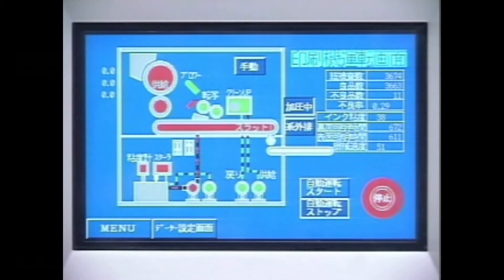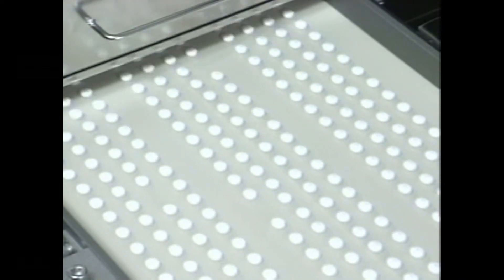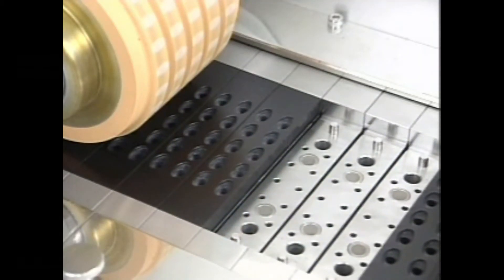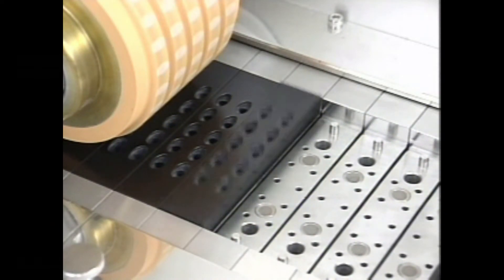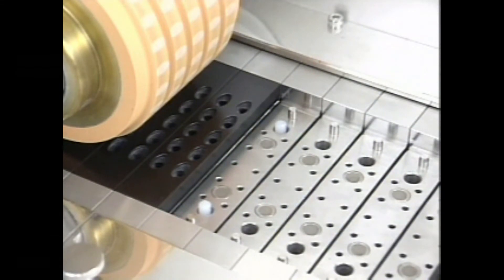The IS500 not only increases the quality of printing and improves the inspection of appearance, as well as improving the product yield, but also is easy to operate. The slat is automatically attached and detached by using a magnet. This makes it possible to shorten the time in case of changing the tablet form or exchanging the slat when washing. This method is superior in operation, reproducibility and washing validation.